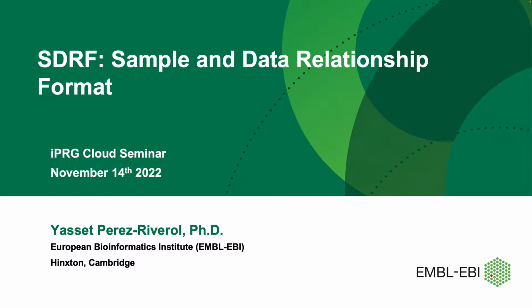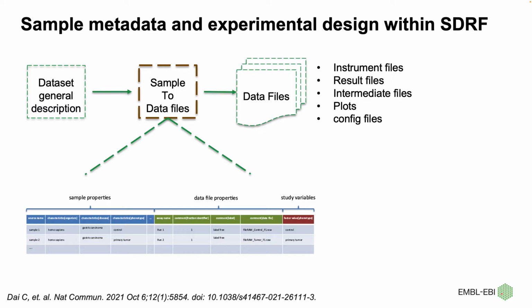I am the team coordinator at the European Bioinformatics Institute. What is actually SDRF? SDRF is a file format that we developed last year. It's published in Nature Communications about how to describe the sample metadata and its relation with the data files.